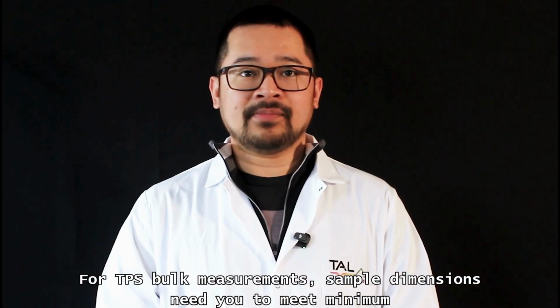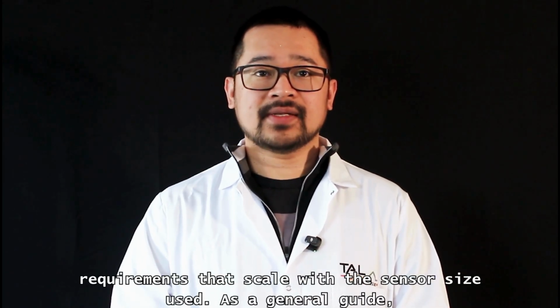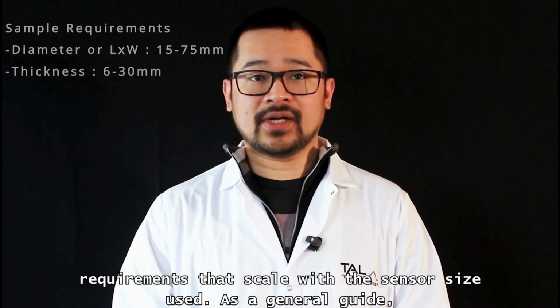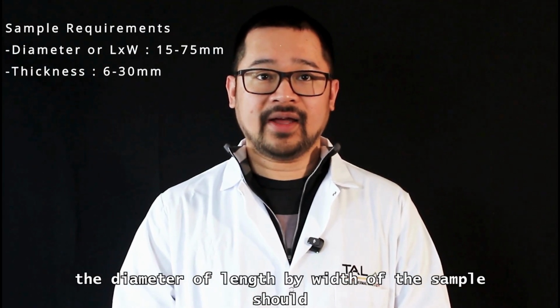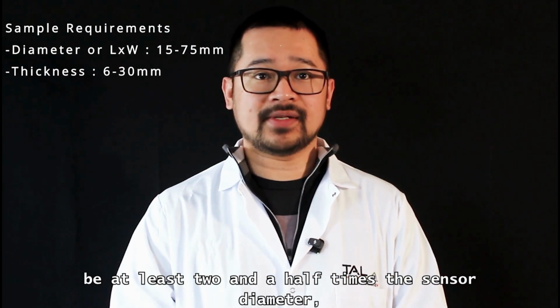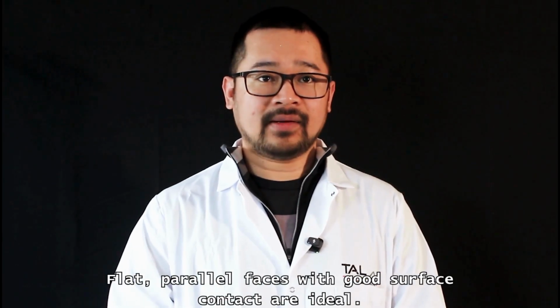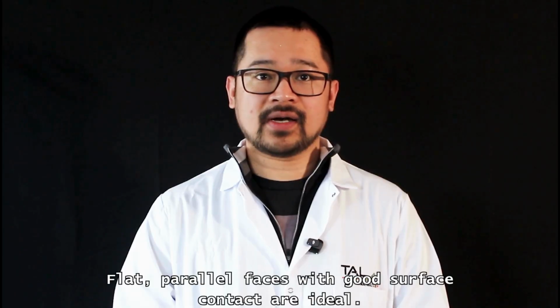For TPS bulk measurements, sample dimensions need to meet minimum requirements that scale with the sensor size used. As a general guide, the diameter or length by width of the sample should be at least 2.5 times the sensor diameter, and the thickness at least 1 times the sensor diameter. Flat, parallel faces with good surface contact are ideal.